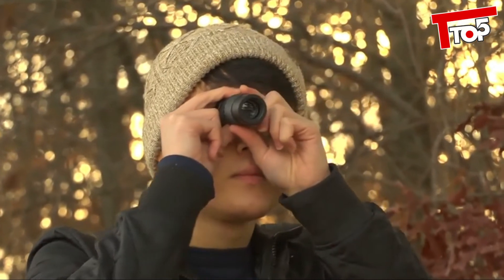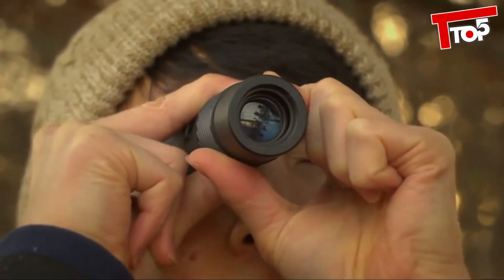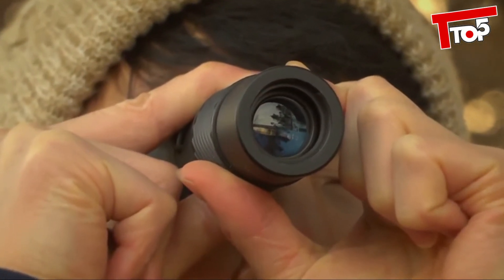First, the lenses on this are multi-coated. This coating is designed to minimize reflections, protect the lens, and improve the overall clarity.